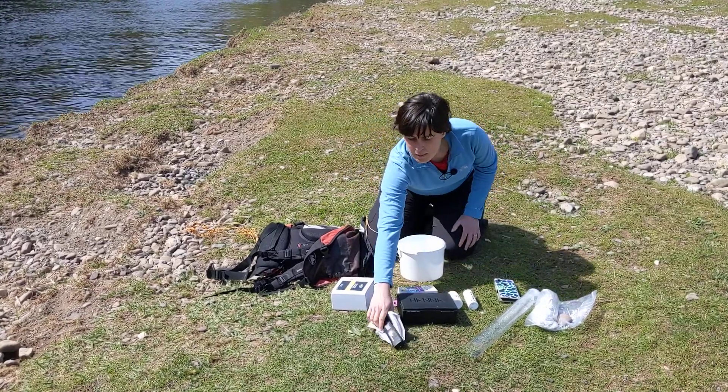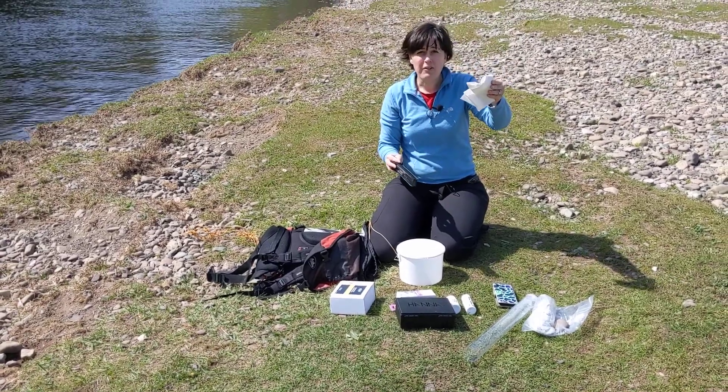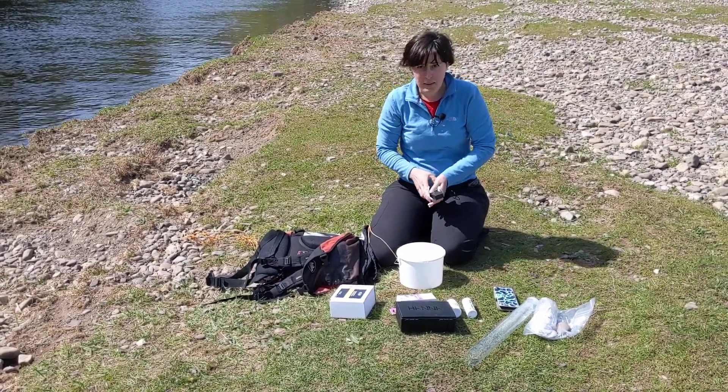I need my electrical conductivity and temperature meter. Also a cloth or a bit of kitchen towel is useful to wipe it off and keep it dry.